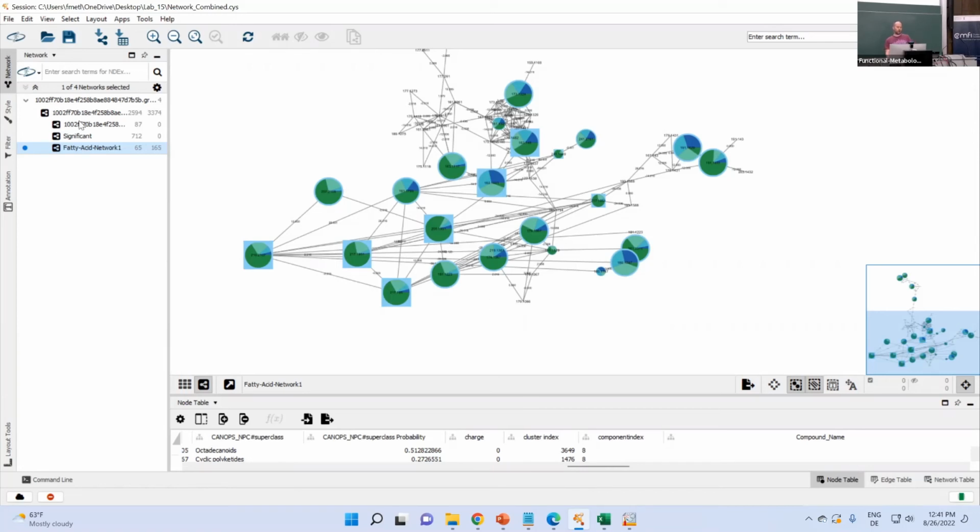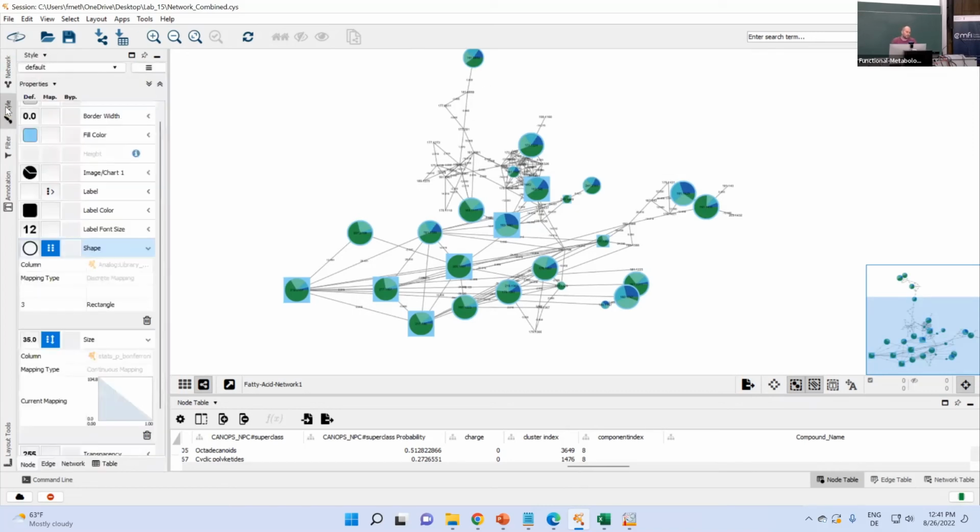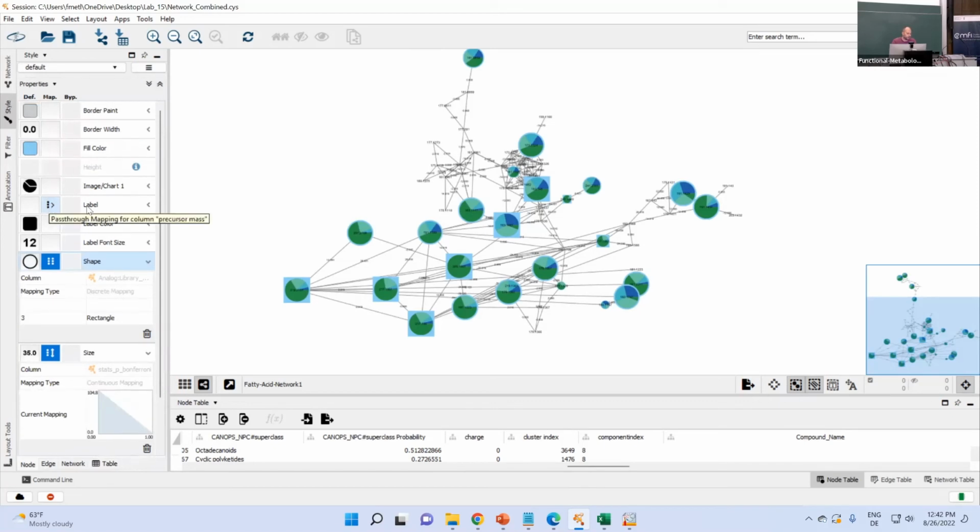That way, I think also organizing the subnetworks that were significant in new networks here, on the left here, that makes it really easy because I can just jump between what is important. But then also things like changing the size of the labels is much more intuitive here than in Illustrator, because there I would click them and then change the font size. So here through the style button again, I can do that very easily.